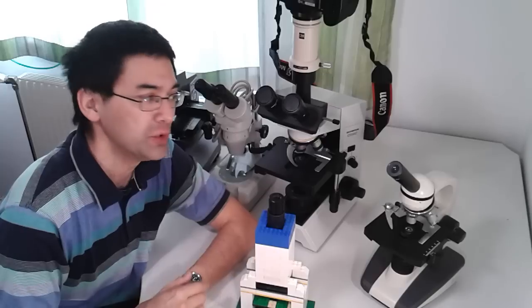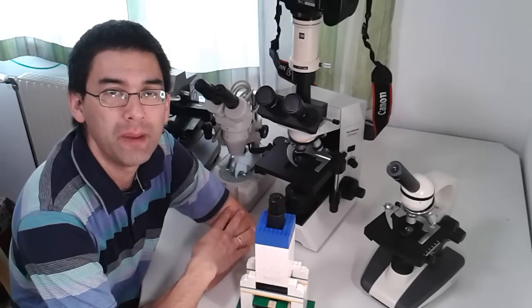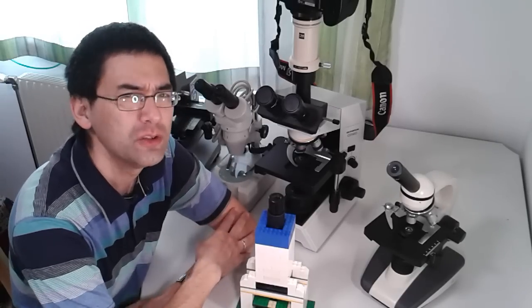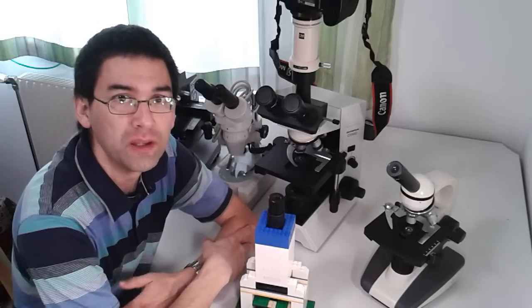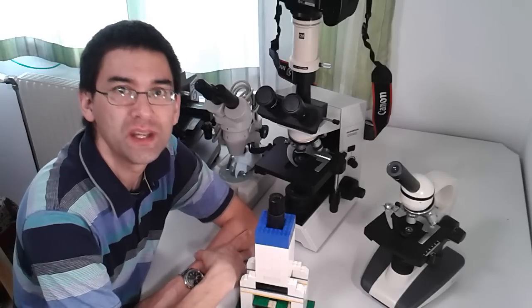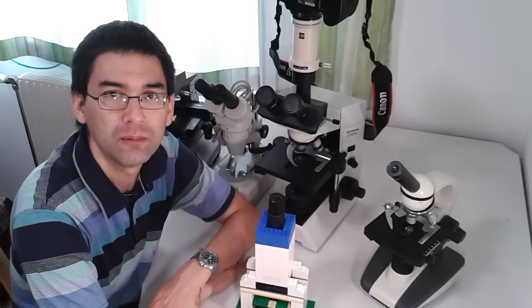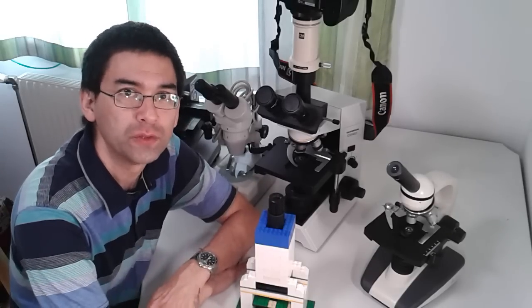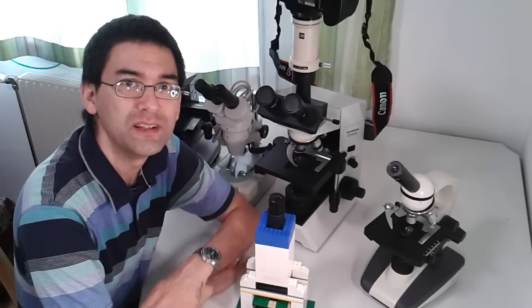Before that, I want to give you a short introduction into these microscopes so you can see what the differences are. The intention of this video is to show you that you do not need a very expensive microscope to start amateur microscopy as a hobby. Low-cost microscopes produce surprisingly good quality images. Nowadays it's quite possible to buy very good microscopes for a relatively low price — this was not the case several years ago.